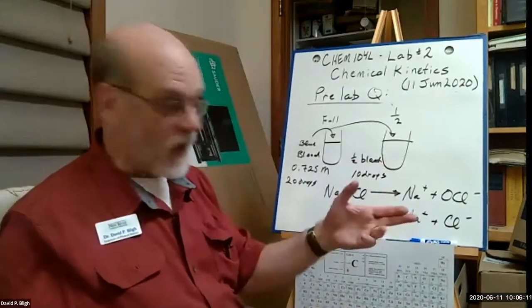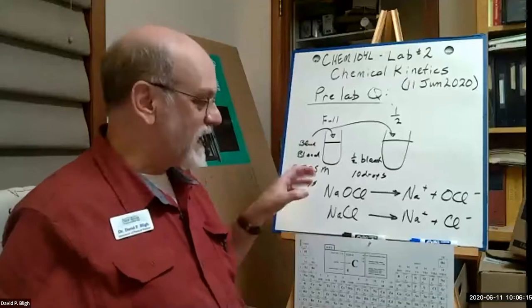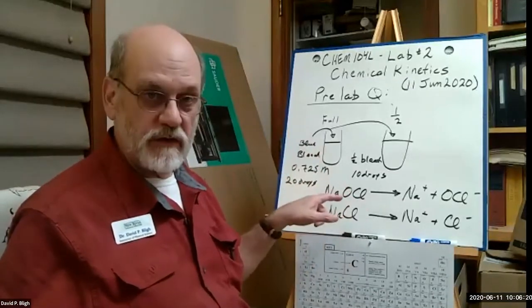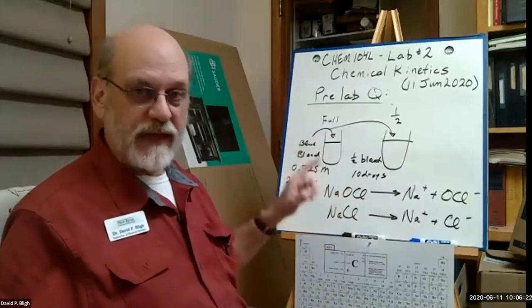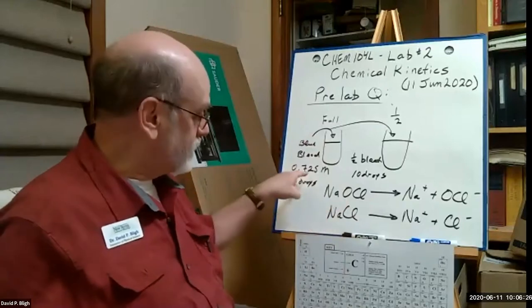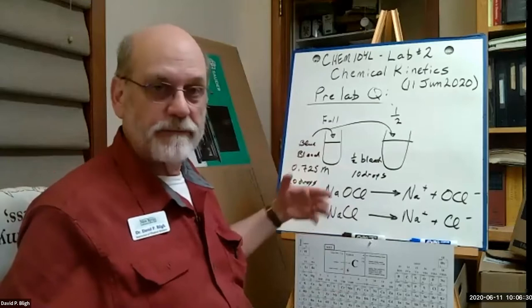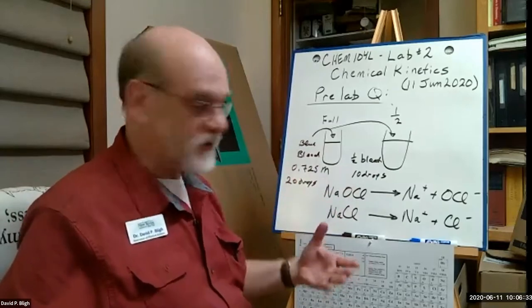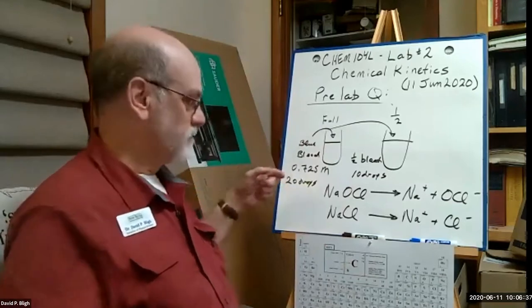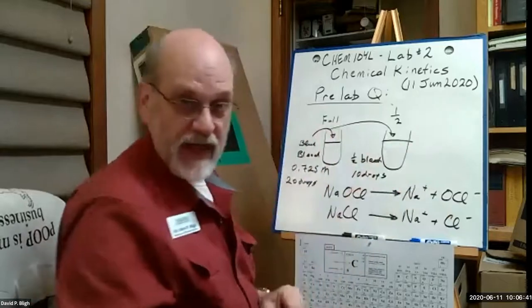So the other 10 drops are sodium chloride solution. But in order to maintain the ionic strength, the sodium chloride solution must be the same molar concentration as the bleach. Right? That's why we need to determine this first. Then we can dilute sodium chloride in a solution to the exact same molarity as the bleach. Right? So then we have a balanced ionic strength for the half-strength experiment.